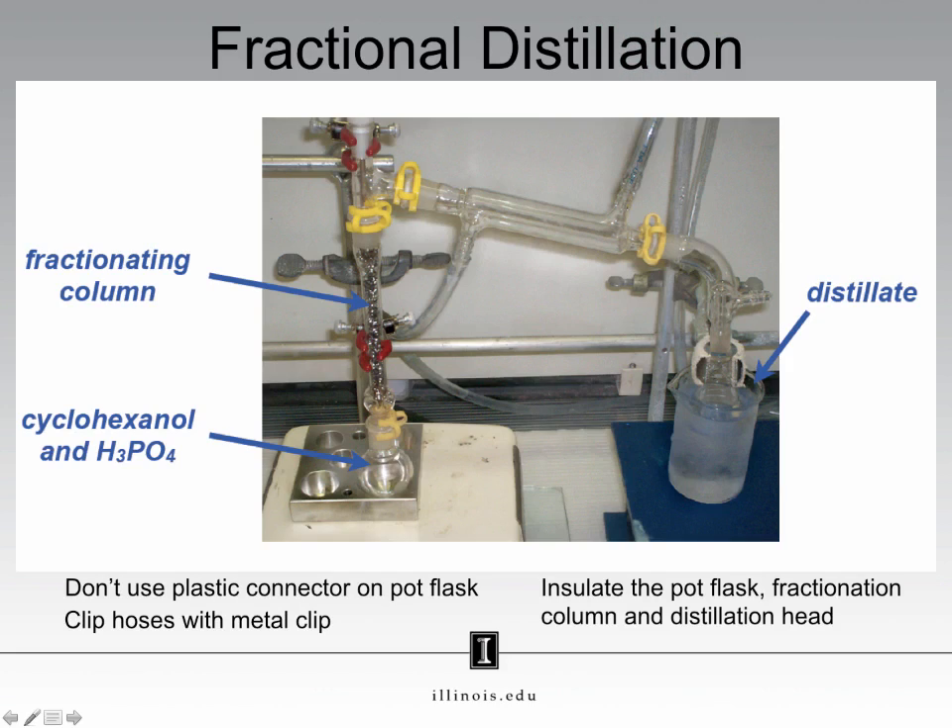This here is a fractional distillation setup. This setup is very similar to the simple distillation you assembled in the previous experiment. We have a round bottom flask, which is where your reaction occurs. You have this condenser, which cools your vapor into a liquid, which allows you to collect it here at the end. The setup is identical to the simple distillation setup, except for the addition of this fractionating column.